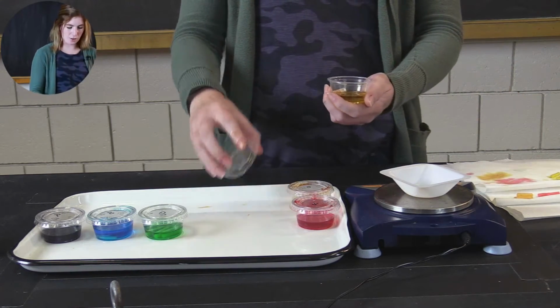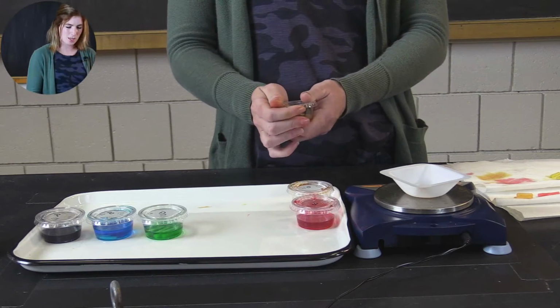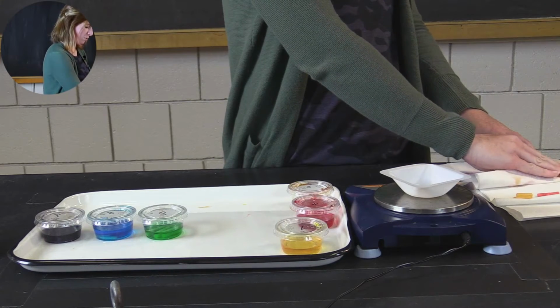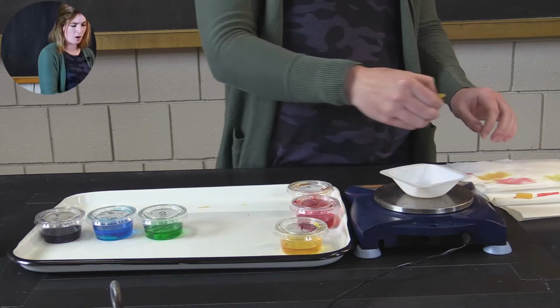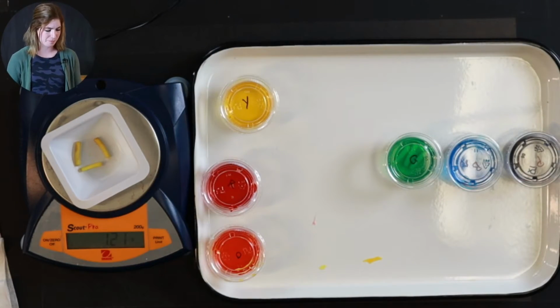As I'm taking these yellow ones out, I'm noticing that they are kind of shriveled up a little bit. And I would like you to think, while you're waiting for me, to maybe get an idea of what does that mean in terms of, did water move into the potato cells or out if they are all shriveled up? Their final mass is 1.21 grams.